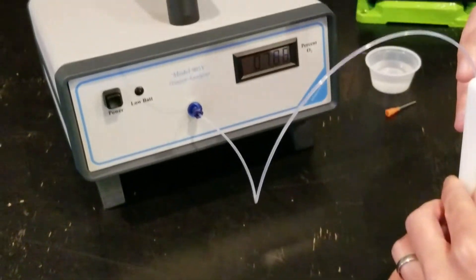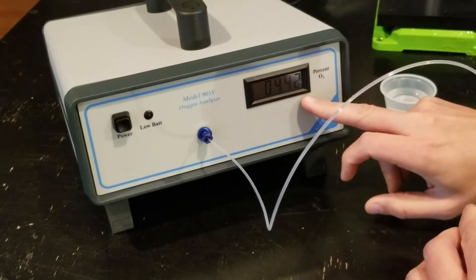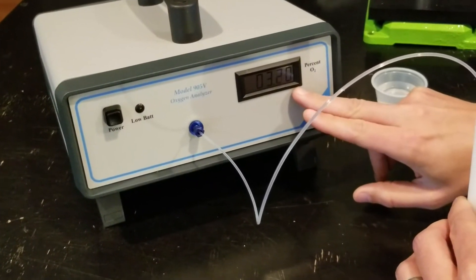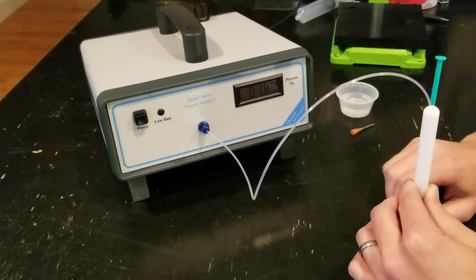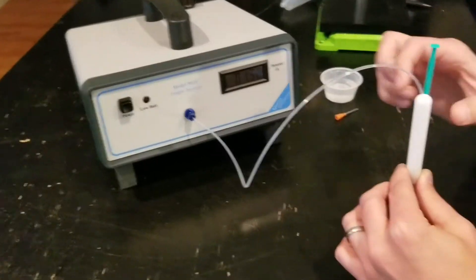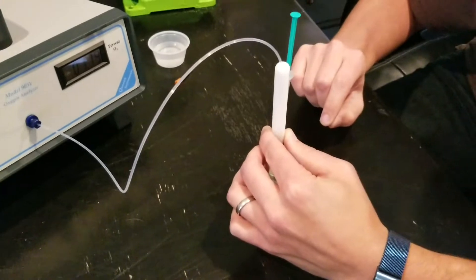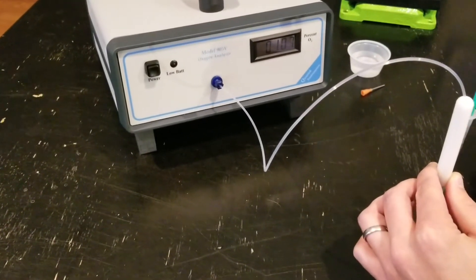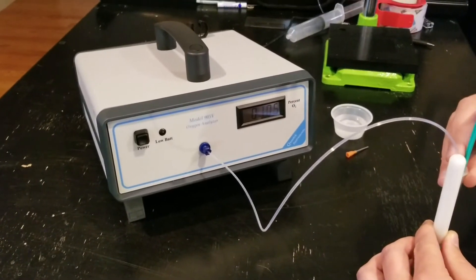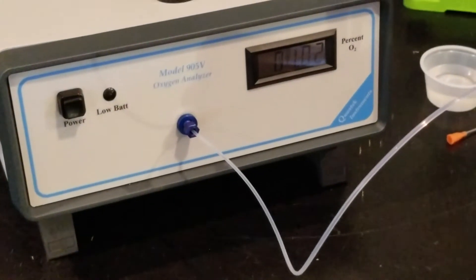As I inject the water, the headspace is forced out of this vial, and you can see with just 0.2 cc's the reading is already starting to go down. The key to this is that the probe and sensor inside are very minimal volume, so we're getting a good reading. It looks like it's going down towards 1% with just 0.2 cc's. I'm going to continue injecting a little bit more water and see if the reading goes any lower.